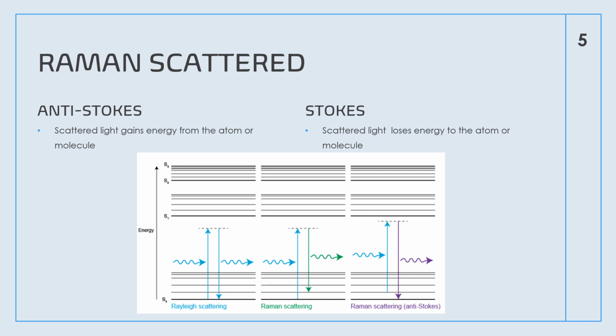The mechanism of Raman scattering is like infrared absorption spectroscopy, but different selection rules apply. For Raman scattering to occur, a change in molecular polarizability is required during vibration. You will see some vibrations in the Raman spectrum, but not in the infrared spectrum, and vice versa.